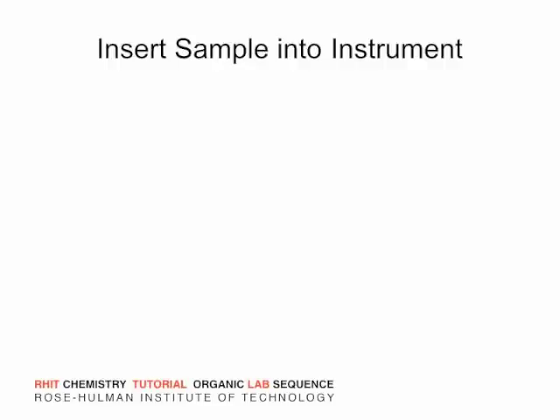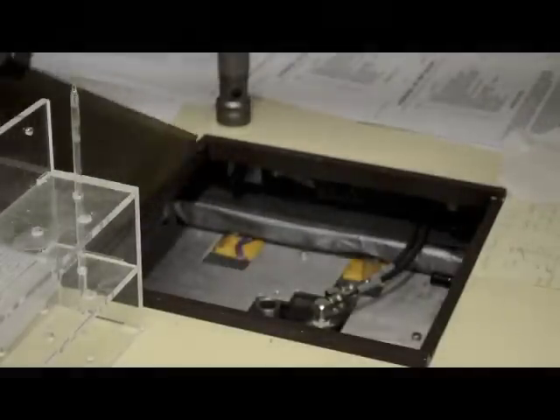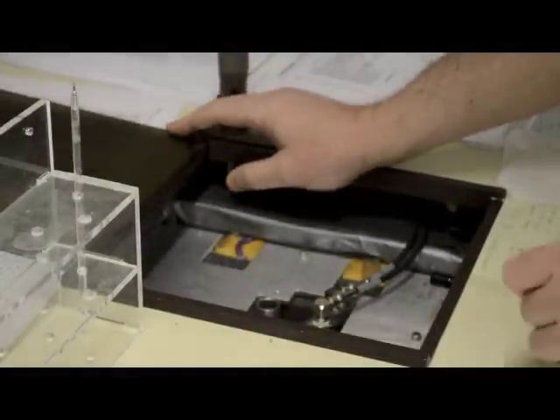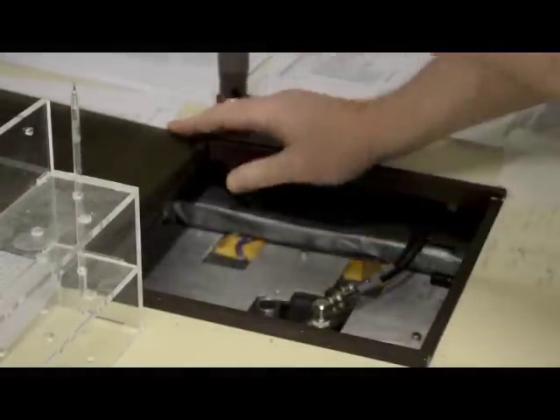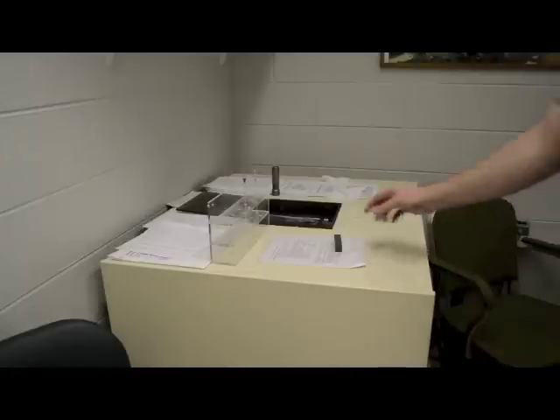Next, go to the NMR and open the sample chamber. The sample eject button is on the right side of the chamber. If a sample is in the instrument, eject it. Be ready to catch the ejecting sample.